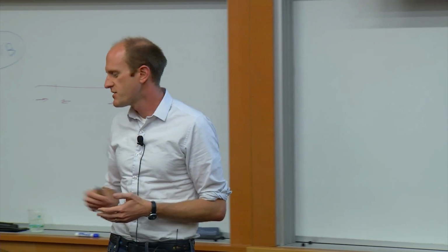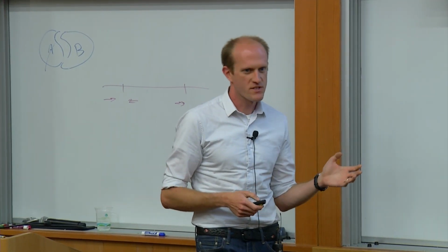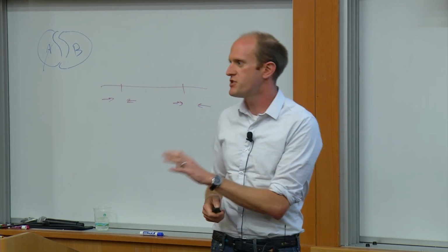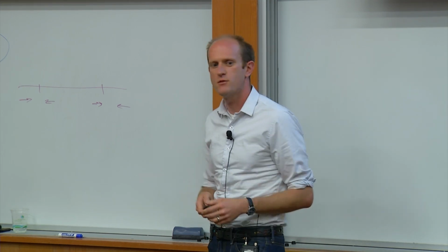So if you see some guide that is predicted to be super active and have 0 off-targets, but you know from something that you've done in the past that, oh, in this particular cell line there's a SNP in this region that makes it similar to this, obviously you wouldn't take that.